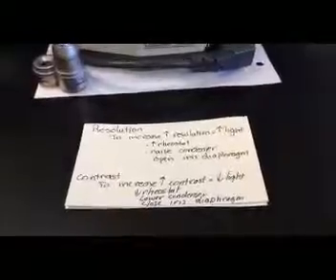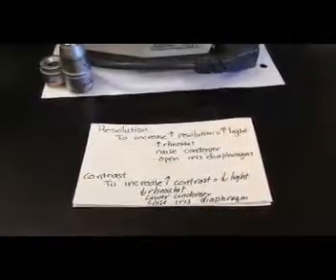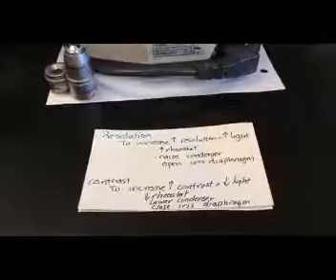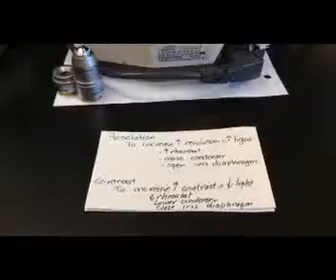This is Chapter 5 Microscopy, Part 2, Take 2. The previous videos were out of focus, so we're trying a different approach here. You'll recall in the last video we were going over the structures, the parts, and functions of the microscope, and we had just gotten to the stage where we were trying to place a microscope slide on the stage when we cut.